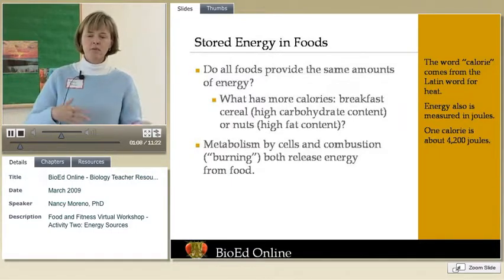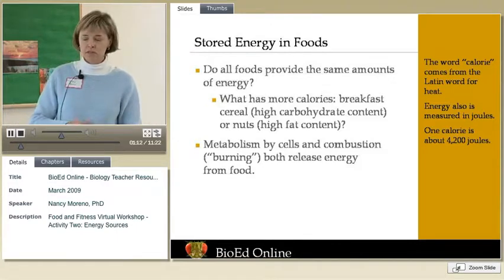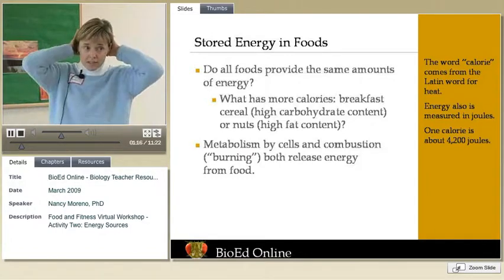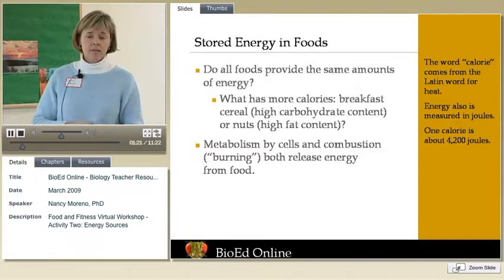So after I explain what we're going to do, I'll give you an opportunity to clear off the top of your desk, and we can get rid of some of the things we've been working with. If you want to eliminate anything that would burn, students would need to have their hair back. They'd need to be wearing goggles. And in many cases, you may want to also have them working on a wet paper towel as their work surface.